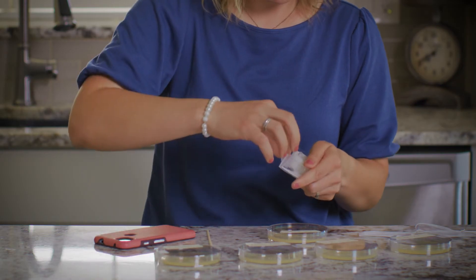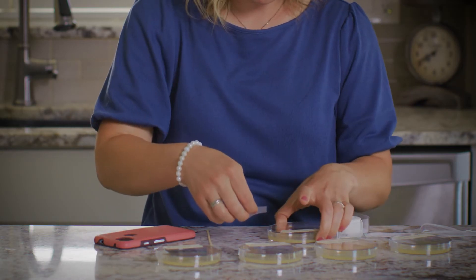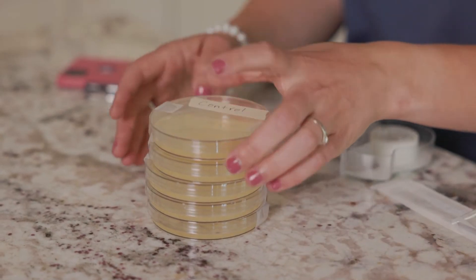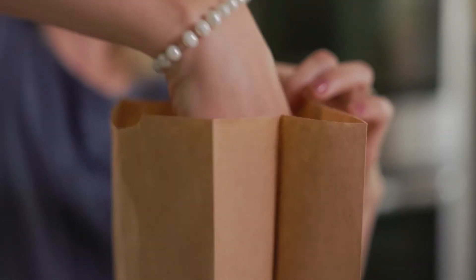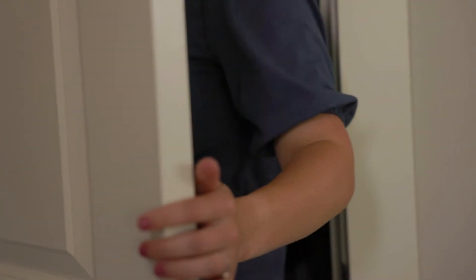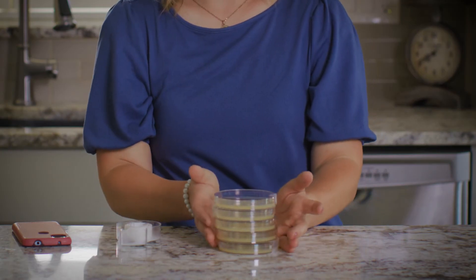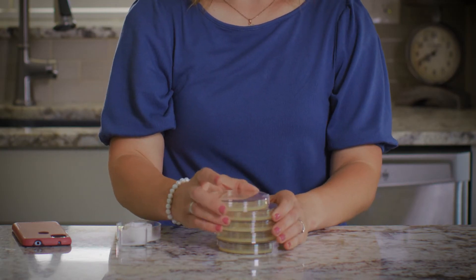That one is ready. Let's put the lid back on this one and secure it with a piece of tape on each side. These plates are ready. They need to be stored in a dark, warm location for several days while the bacteria grows. Fortunately, we don't have to wait several days because I have some plates here that I prepared a couple days ago.